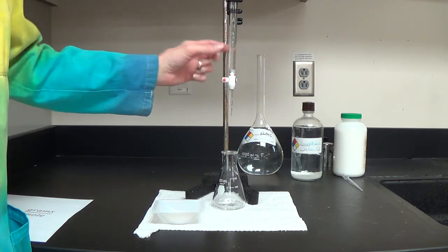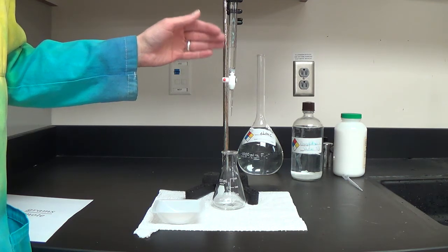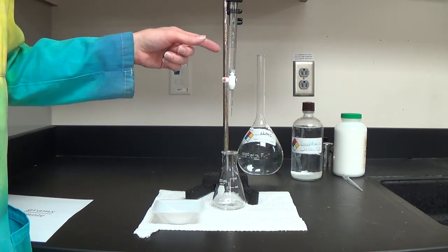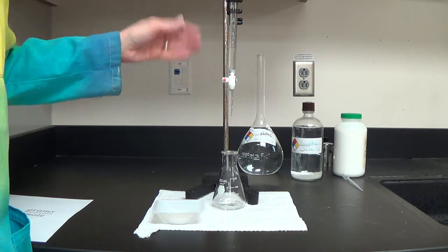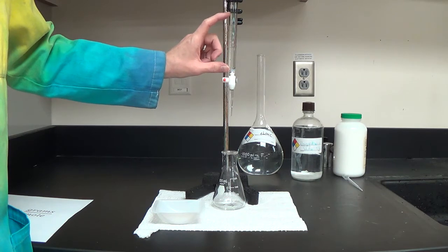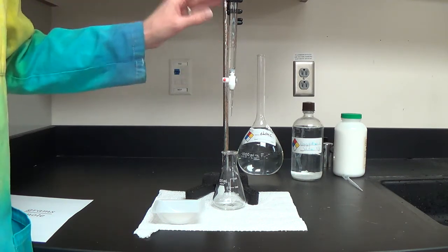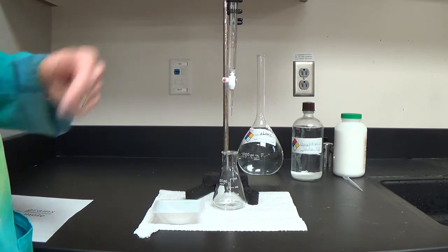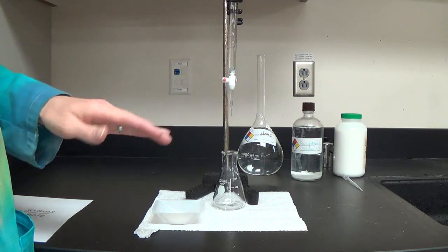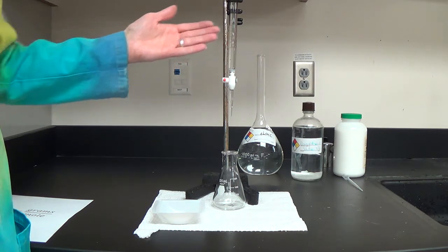We did the same thing with our pipettes — we rinsed them with water and then sucked in some of our solution and squirted that out before we used them. Same thing here. I put some of my sodium hydroxide into my burette, swirled it around and let it drip through the tip, using about 10 milliliters. It is a necessary step to double rinse it: rinse it once with water, rinse it a second time with your solution. Then fill it with your sodium hydroxide, because that is our titrant this time.